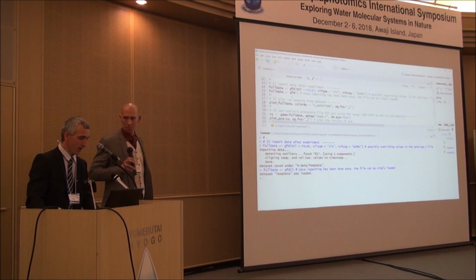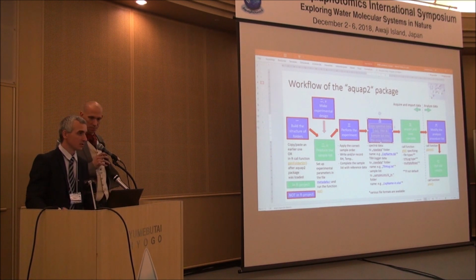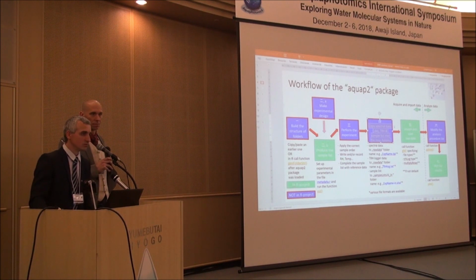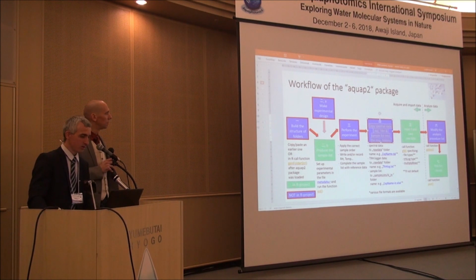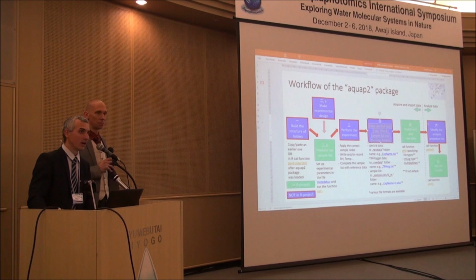So actually after this, we are already at this stage, we can start the data analysis. So this lot of time what we needed to take now is not required all the time. Once you are set this way, then you did your experiment, copy the files in the respective folders, you run this one single line, and you are there to analyze your data.